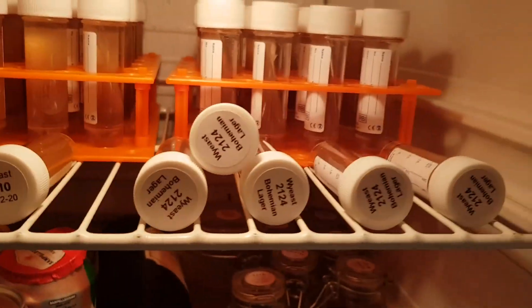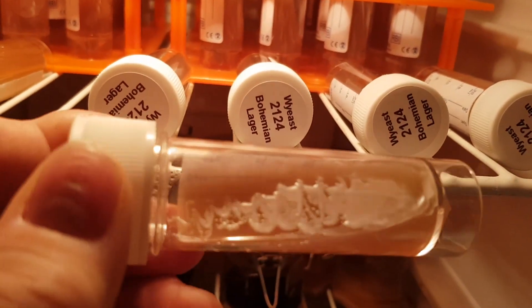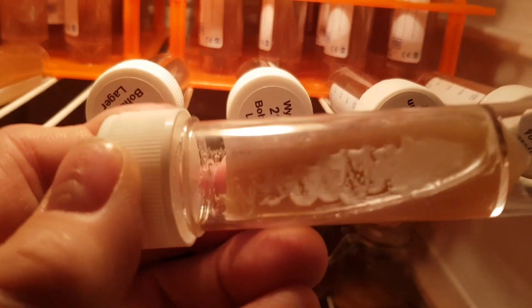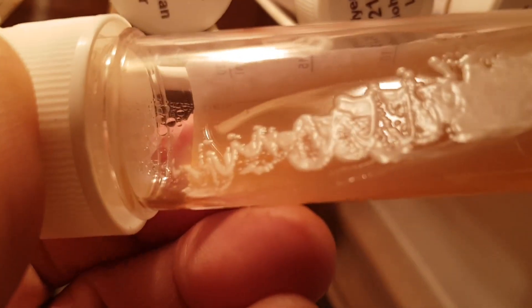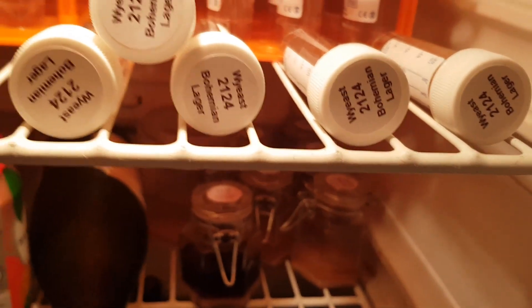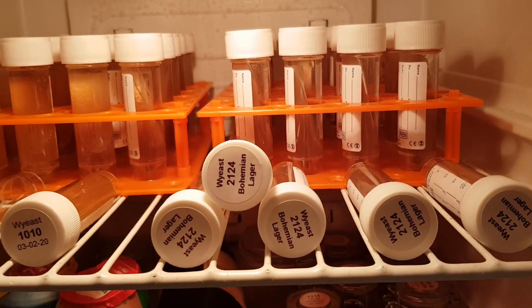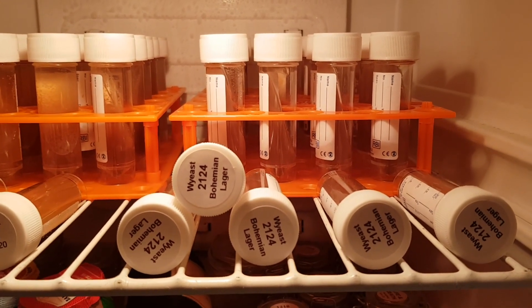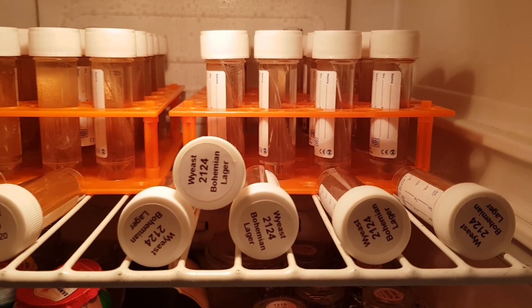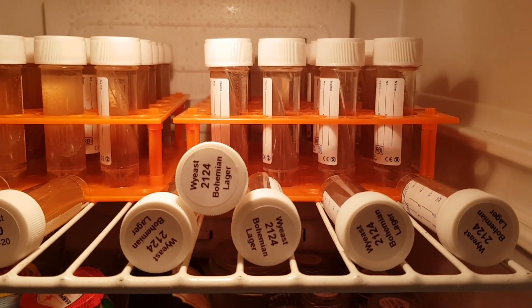So that's the bank. In order to revitalize these, you take an inoculation loop and take a tiny amount — you don't need much — and you put it into a small flask and gradually grow it into a large couple of two-litre or so starter.